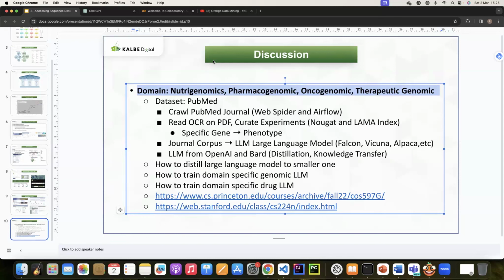For the rest of the 30 minutes, you can keep discussing Terra Bio and look at Terra Bio features. If you can run one workflow, then others can run other workflows. So you can also do collaborative learning: each participant takes one workflow and shares it with each other. Feel free to do that, because learning and working together is faster than doing it yourself. That's it from me. Please continue with Fadin and Cinta.